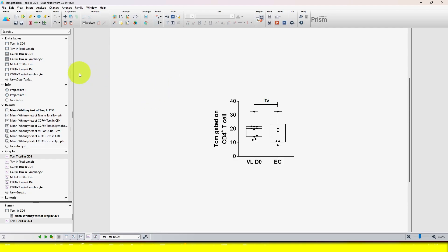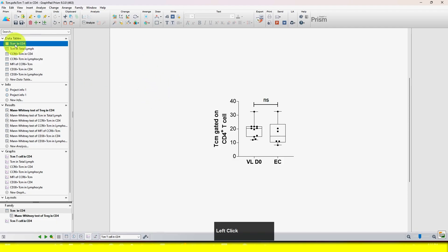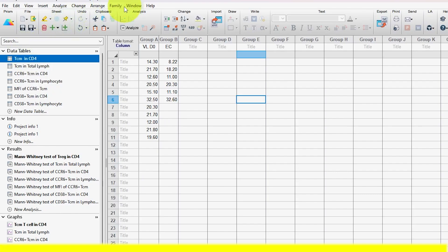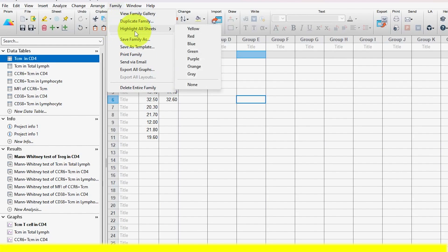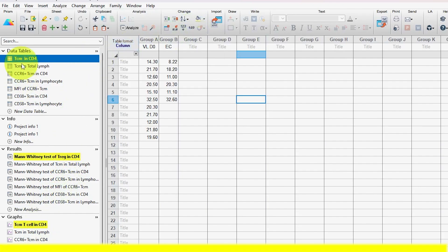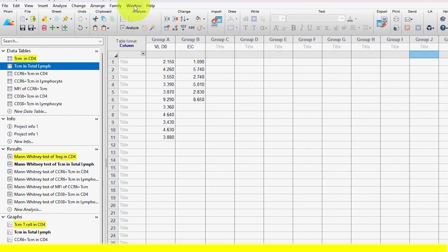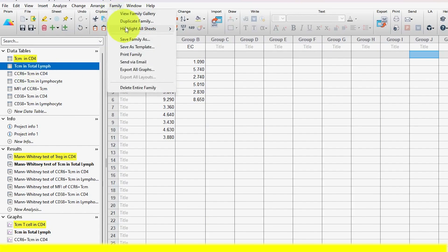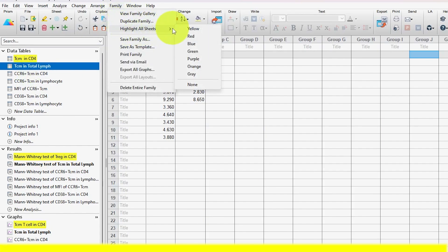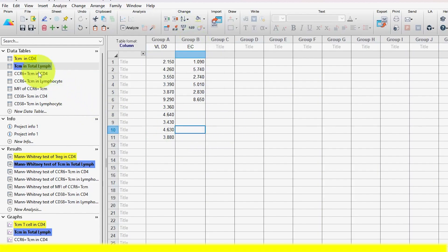Another useful feature: if you want to highlight the associated files, select a file, go to the Family option in the menu bar, click on it, and you can see 'Highlight All Siblings.' You can highlight them with a color — for example, I'll select yellow, and you can see all files associated with this data file are now highlighted in yellow. For the second group, select that file, go to Family, click Highlight, and choose blue. In this way, you can color-code your associated files for easy identification.